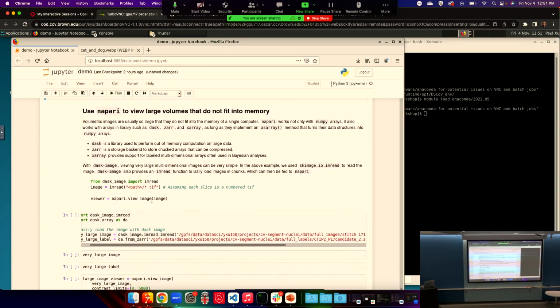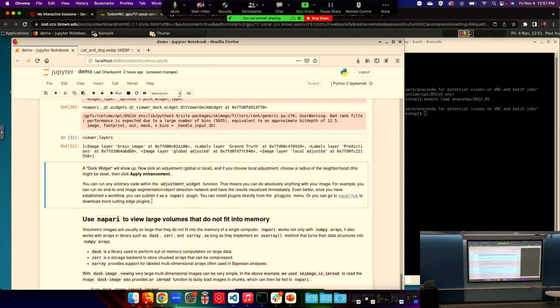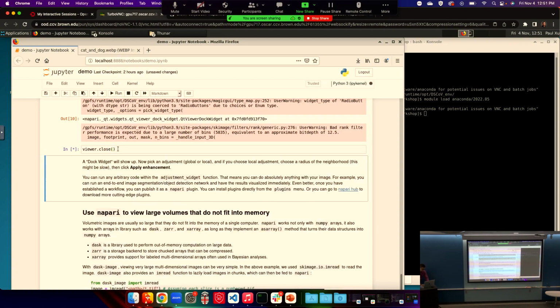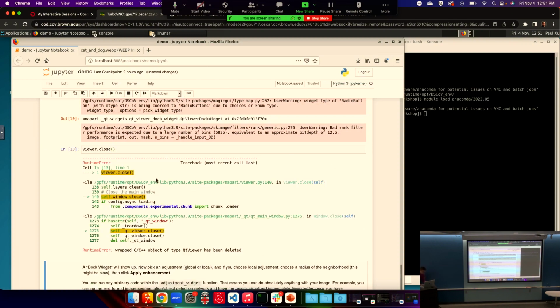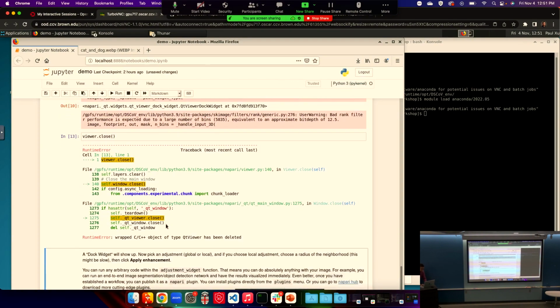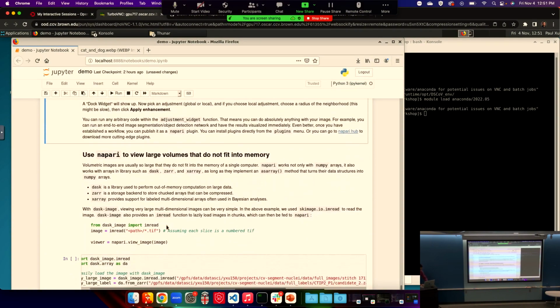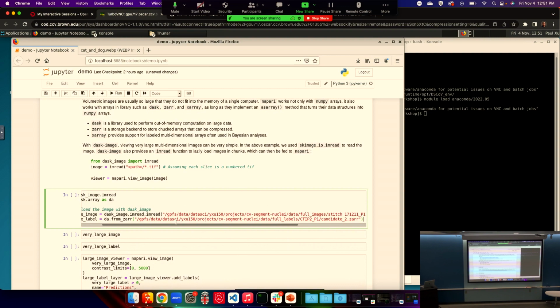All right, so let's move on. And now we do need another viewer. So maybe let's just close that viewer. Yeah, it says it has been deleted. So, okay. Yeah, because this task we need a lot of memory for.